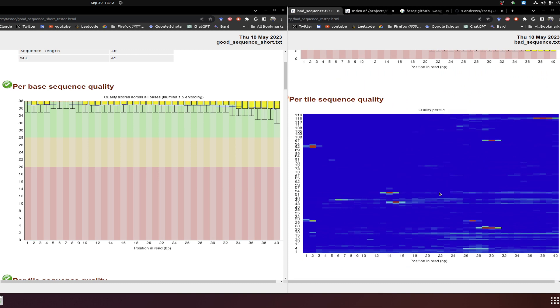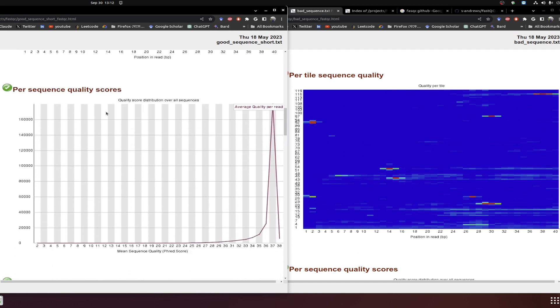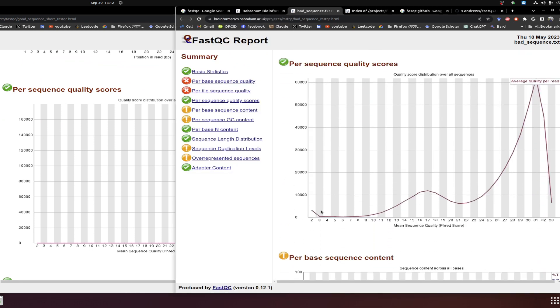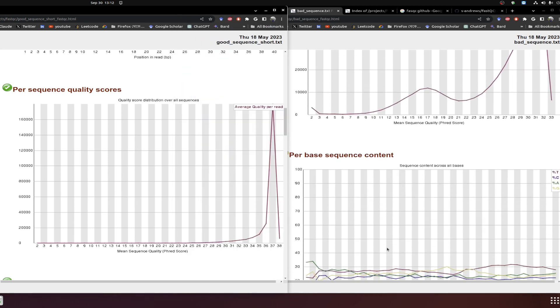The next module is per-tile sequence quality. This means that if the flow cells used during sequencing have an issue, it will create quality variability per tile, which ruins the overall quality. After that is per-sequence quality score, which shows the mean quality score per read. If it's biased, the average quality score may look acceptable but with variability, which may not be impressive but can still be workable.